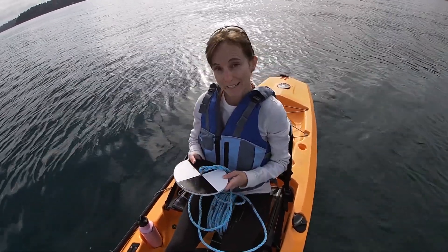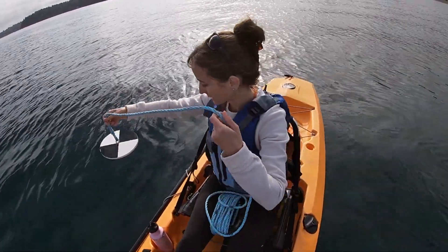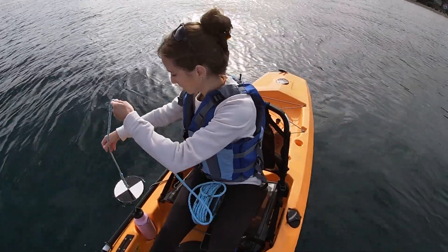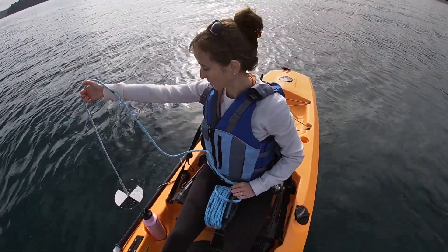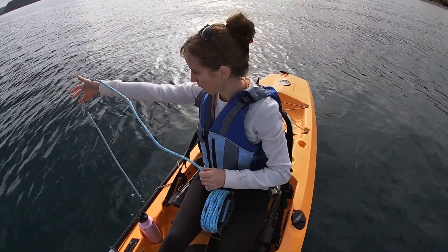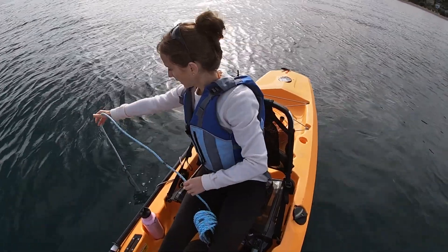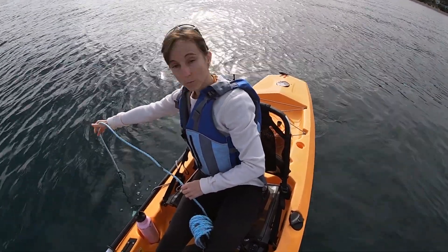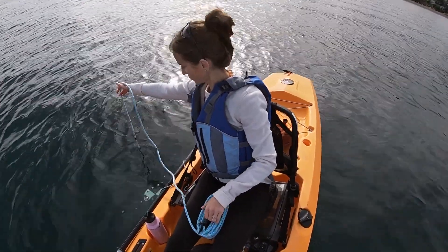In order to take a Secchi depth reading, I'm going to lower this disk into the water until I can't see it anymore. Right now it is at zero meters depth, right at the surface. I'm just going to let it fall — that weight is going to drag it down. Right now the one meter mark is right at the water surface, but I can still clearly see the disk.